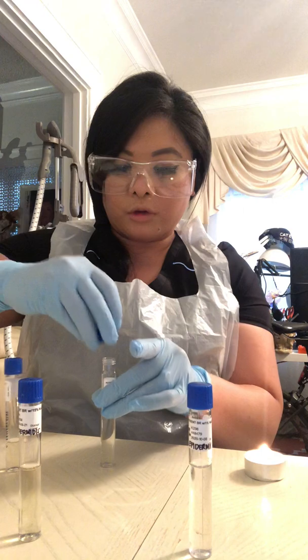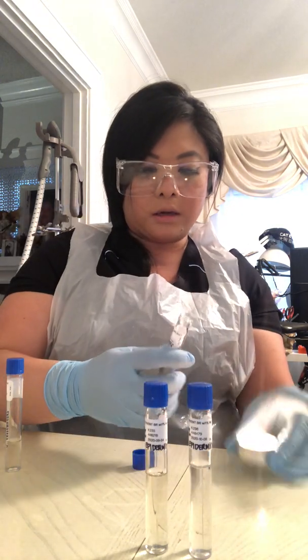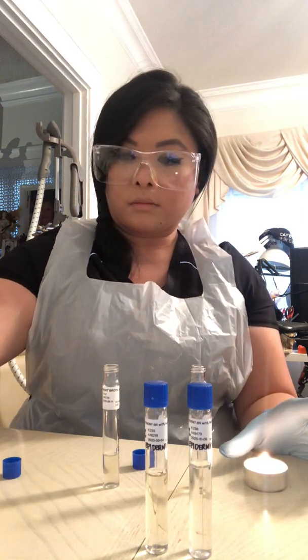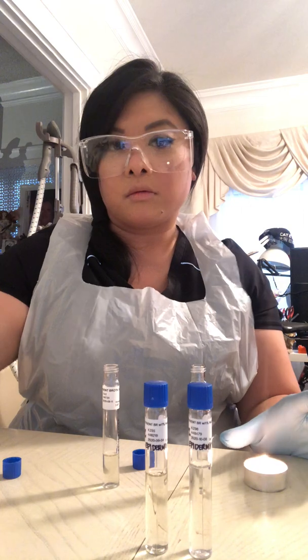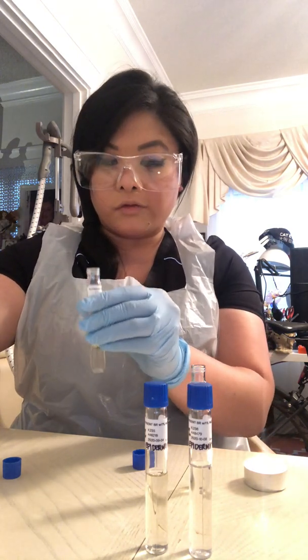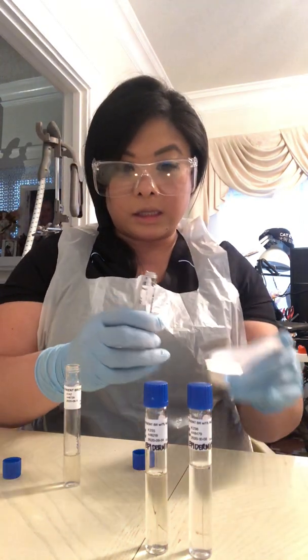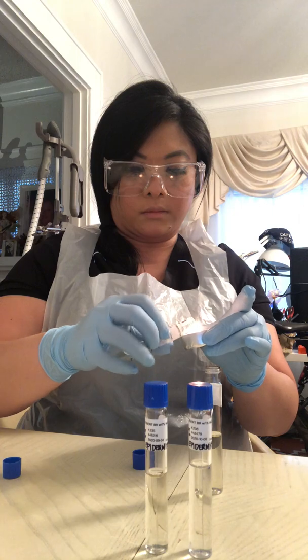And then after that, I will grab my 15% sodium chloride, and I'm going to sterilize both of them again. I'll grab my pipette, make sure it's dry. And then I'm going to collect 2 drops again of the bacteria, and then drop 2 drops into the sodium chloride. Then I'm going to sterilize the lid of both, and then I'm going to recap.